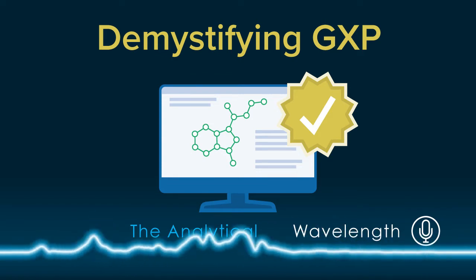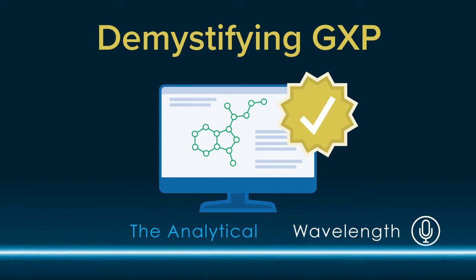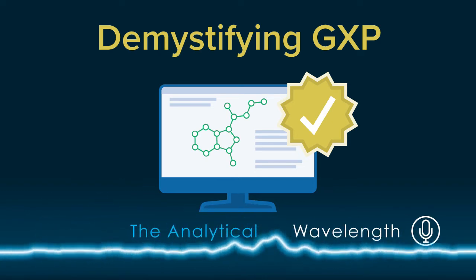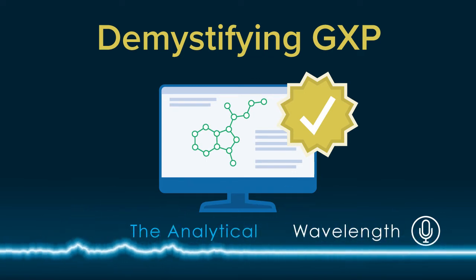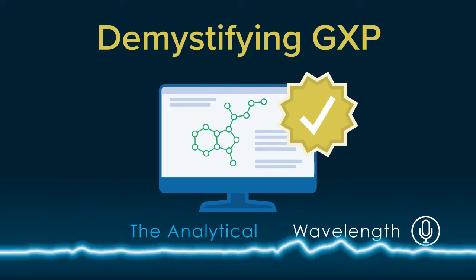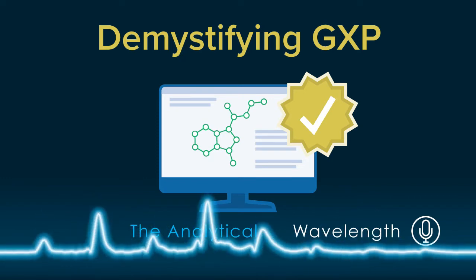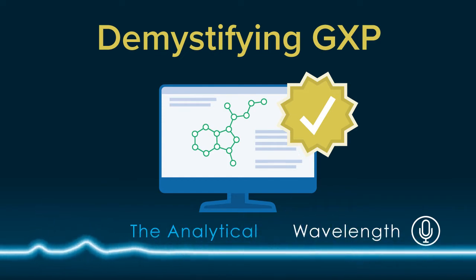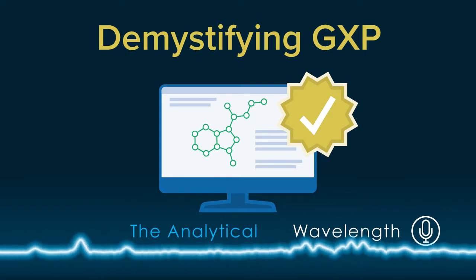The process of software validation, from what we've been involved in, requires a company to perform installation qualifications, operation qualifications, and performance qualifications. So these are all documents that have to be filled out to document that the software has been installed correctly and is operating within their environment. And this is the key point when you're doing these IQ, OQ, PQ scripts, that you have to make sure that you do them within your environment and not as the software comes from the vendor. It has to be qualified once it's in your environment and installed.